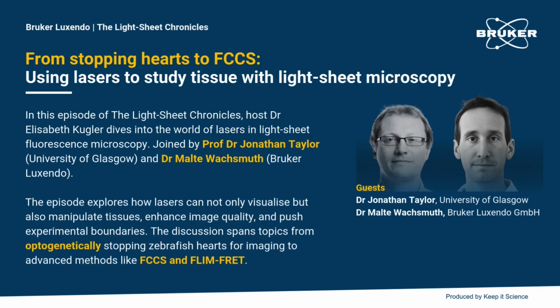So it's tackling some of the same challenges that Malte was alluding to, but by a slightly different method. So for fluorescence lifetime imaging, whenever we excite fluorescence using a laser, most of the time we assume that the light we get back is basically instantaneous. But in reality, we excite the fluorophore with the laser, and there will be a stochastic delay of a few nanoseconds before a photon is actually emitted. Most of the time that doesn't matter. But that average delay is the fluorescence lifetime.